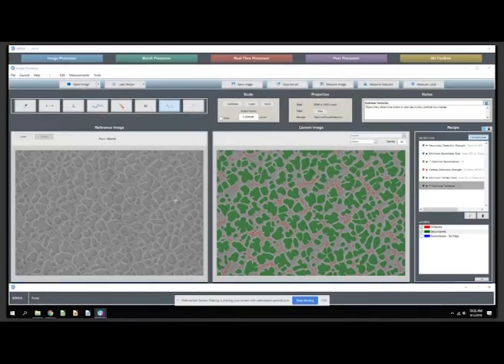Because the recipe produced objective measurements, and then those measurements were validated by another approach, that gave NASA great confidence that this algorithm paired with their imaging technique can likely become the new standard for gamma prime quantification.